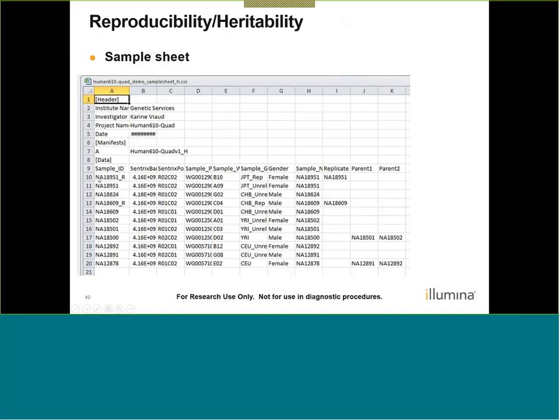After looking at this, the first sample is the R version, and then the sample replicate is the one without the R in this case. So you only need to make this designation once. In other words, you don't have to go to the entry of the second one and repeat the designation by naming the alternative sample in the column. So just do it once, all right?